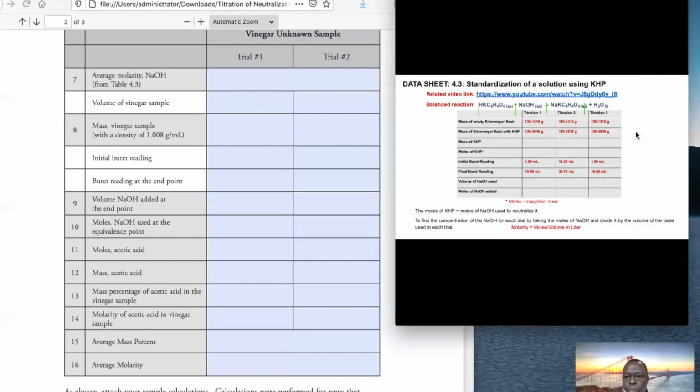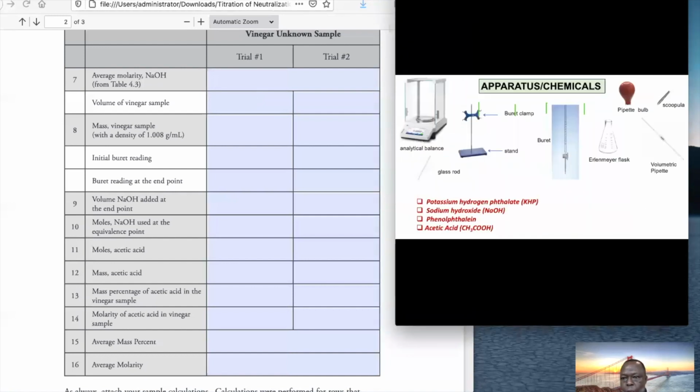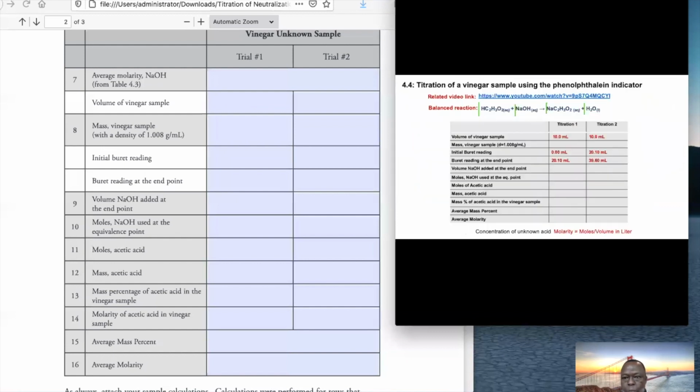All right. So at this point, this is what they used. The instructor used this piece of glassware with a capacity of 10 ml with a calibration mark, using the bulb, and 10 ml were transferred into the Erlenmeyer flask, and the titration went this way. 10 ml of vinegar, 10 ml of vinegar. So you know the volume of vinegar used, not acetic acid. Don't think that we are pipetting acetic acid. We are pipetting vinegar solution with acetic acid in it. And what will react in vinegar with NaOH from 4.3 is the acetic acid.